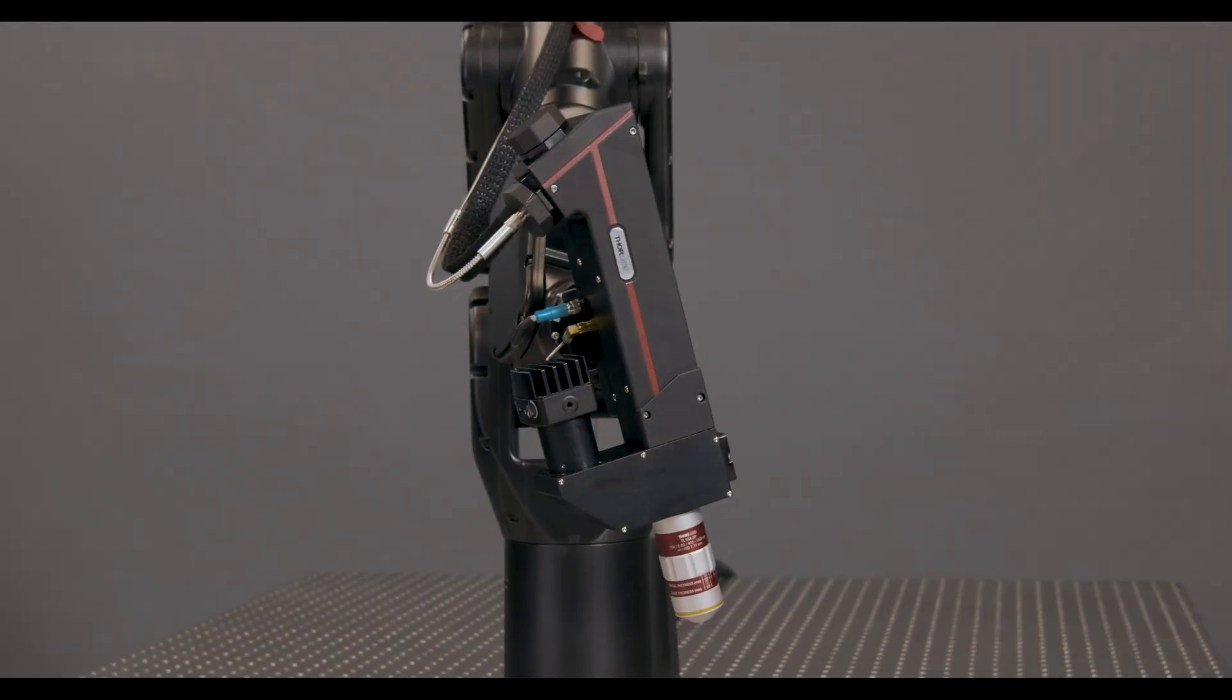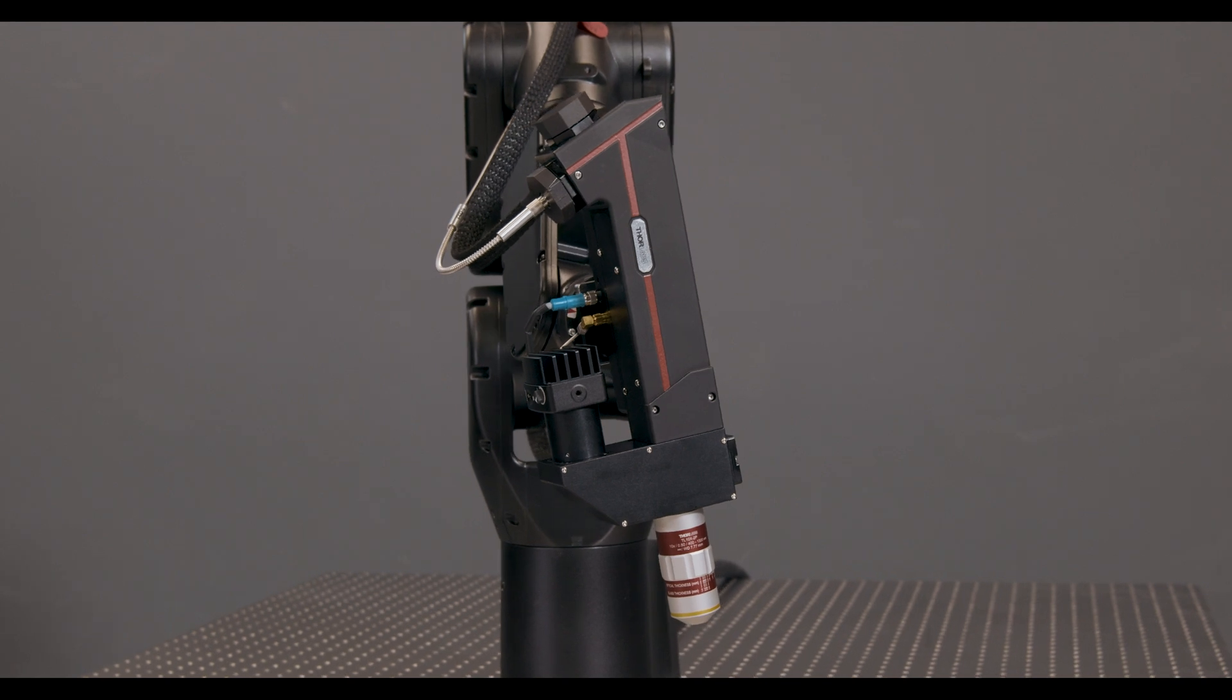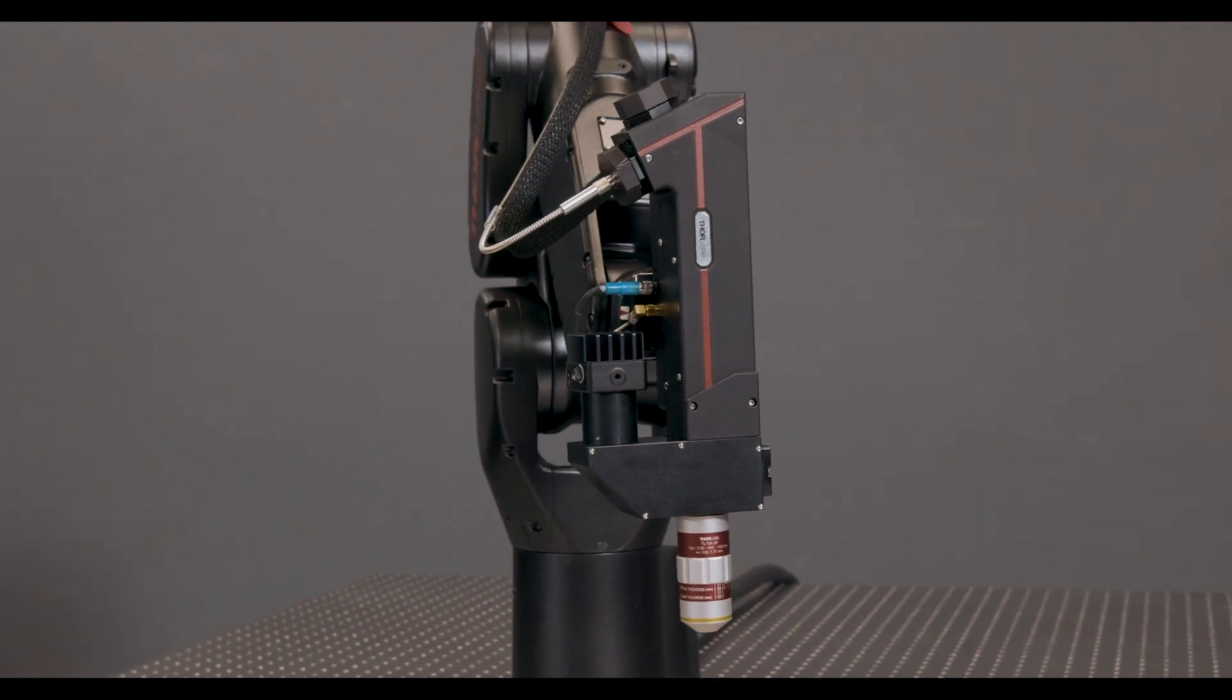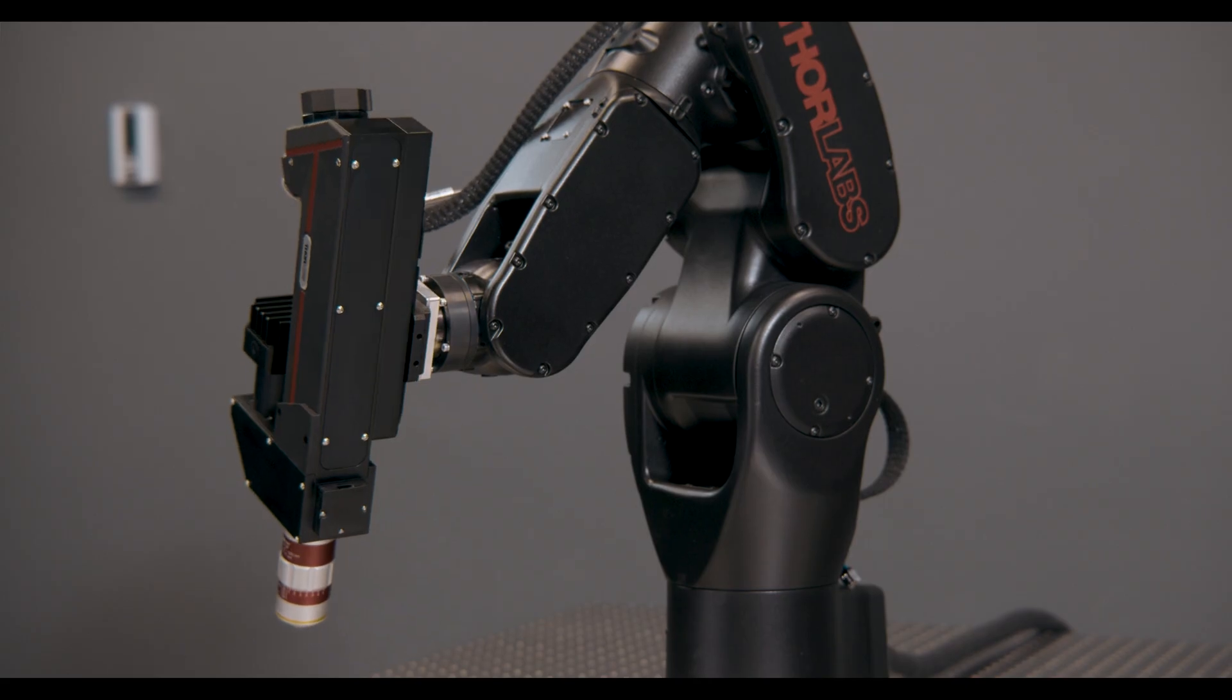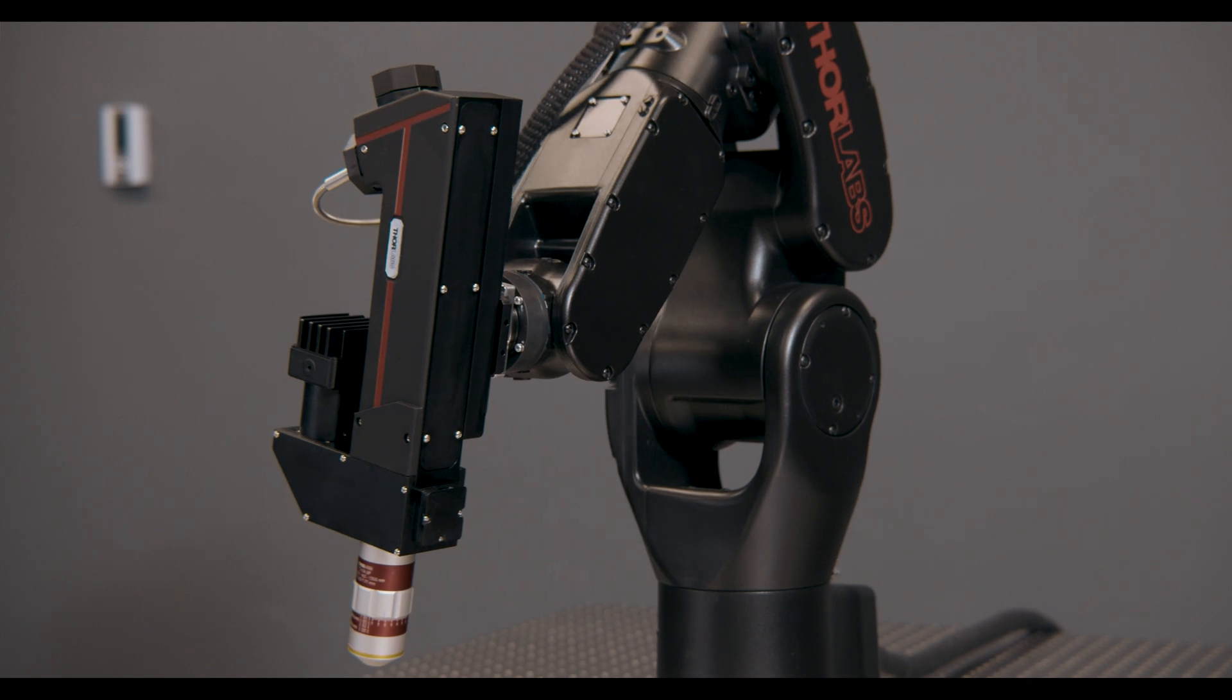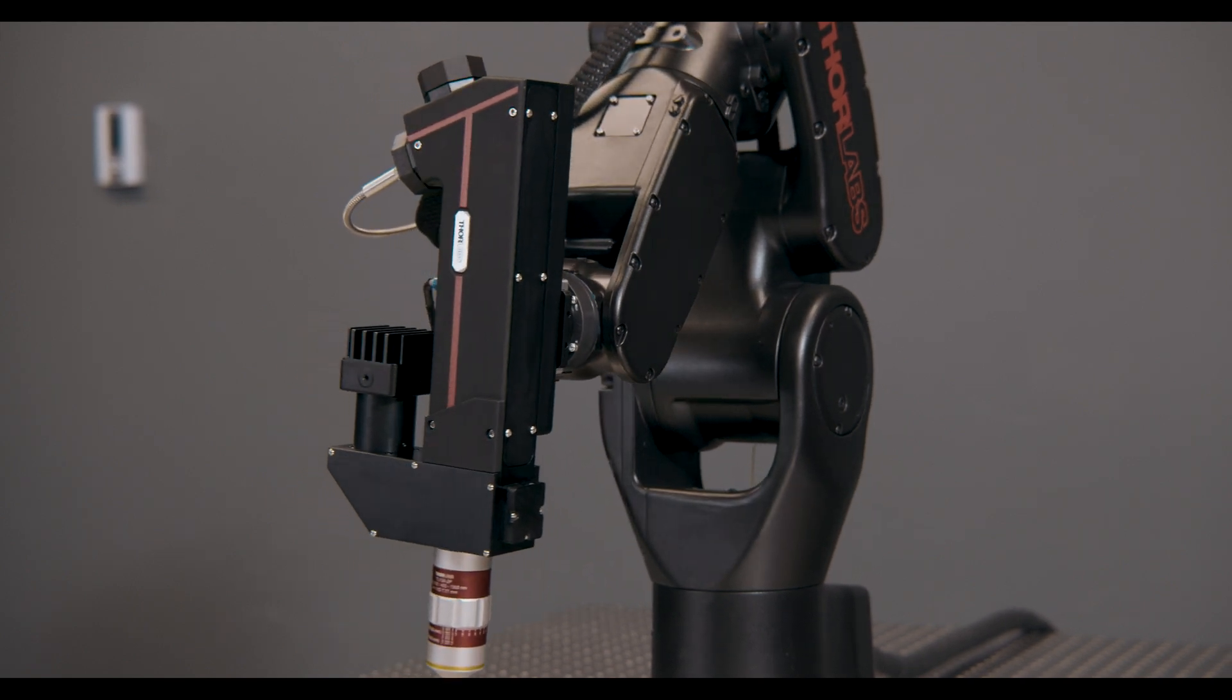To get there, it's a marriage of optics, mechanics, and electronics that's really unprecedented in the field.